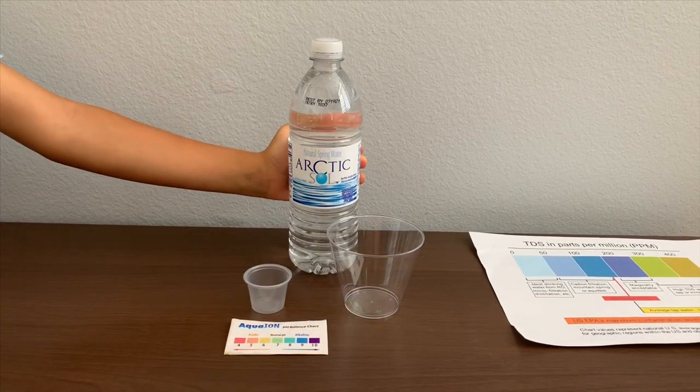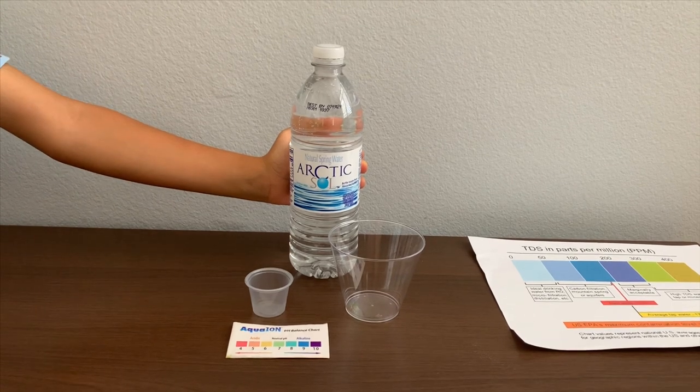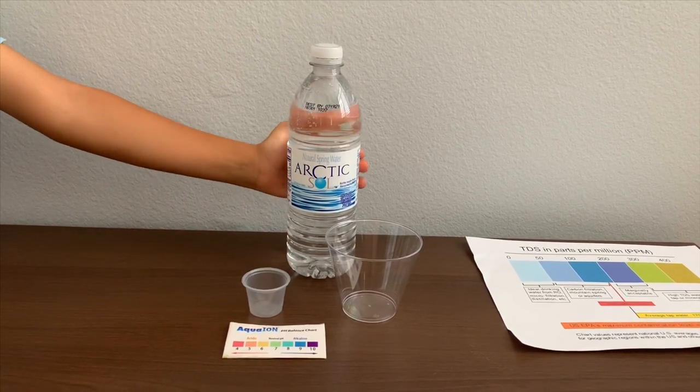This is Arctic Soul Natural Spring Water, sourced from California. It costs $3.79. Let's test the pH and TDS levels.